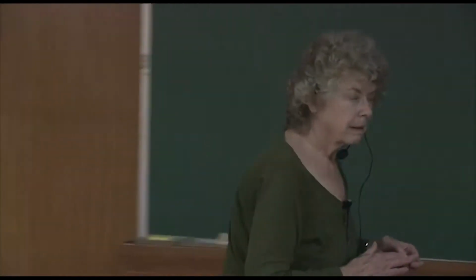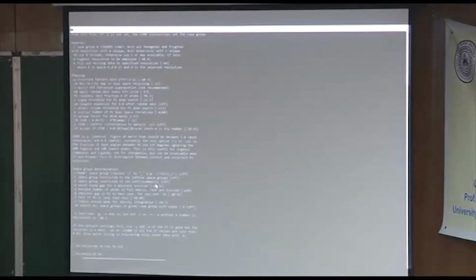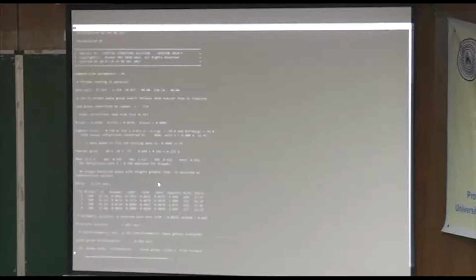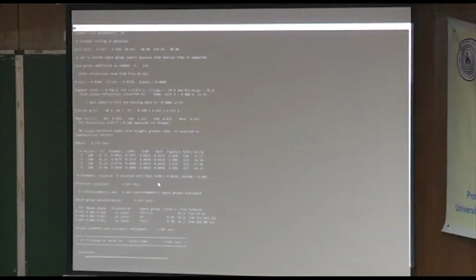All right, so I was at this point here where I was going to run the program XT by just saying xt hk. The other remarkable thing that it does is it adds extra data. If you have gaps in your data collection, it tries to fill them in for you. It's really a genius program.